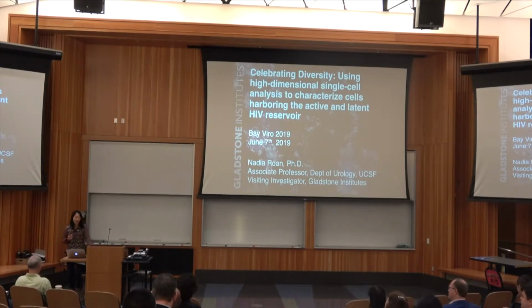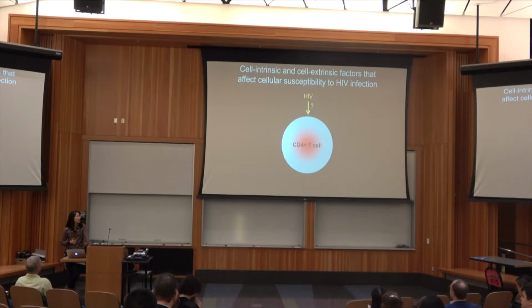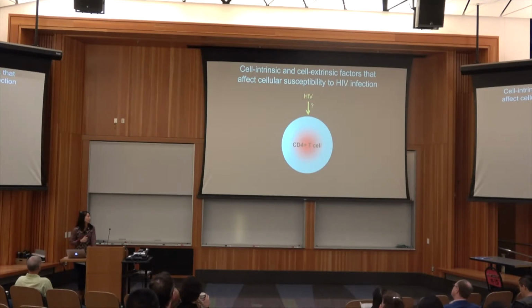Today I thought I would share with you some of the work going on in our lab using CyTOF to characterize the properties of those cells most susceptible to infection by HIV. But before jumping into that, I thought I would say a bit about what, in general, my lab works on. One fundamental question that many individuals in my lab are focused on addressing is what makes some cells more susceptible than others to HIV infection.